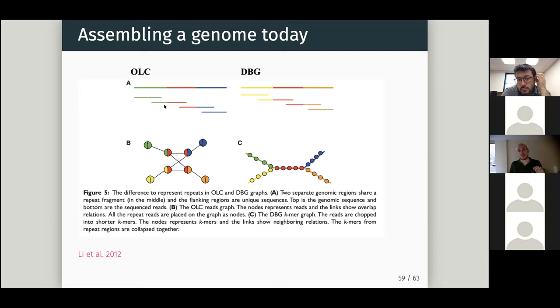That's the whole point. And you could see this in the T2T assembly that Olivier was showing before. Basically, you have all these chromosomes, and there were some that I was mentioning, the rDNA, where there are 5 of these repeats, almost identical, on different chromosomes, and they're all tangled together because you don't know which one is which and how to walk through these repetitive elements.